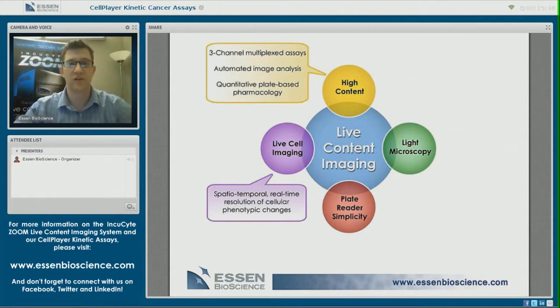And these analyses can use methods that you probably haven't used before to determine pharmacology using kinetic data, such as area under the curve, peak responses over the time course of the assay or a concentration response, or informed single time point measurements, where you pick the time that's most relevant for processing or analyzing your data.